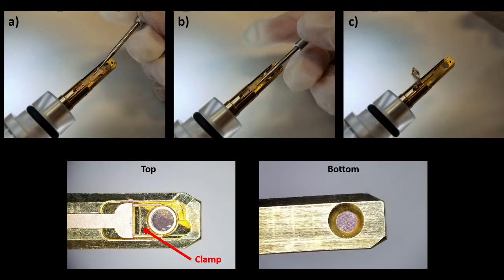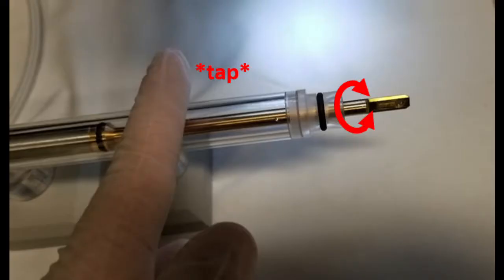The images in the lower portion of this figure show a correctly loaded TEM grid under the microscope. Once the sample is in the clamp, you want to rotate the holder, tapping very gently to ensure that the TEM grid is secure. The last thing we want is for your sample to fall into the column.